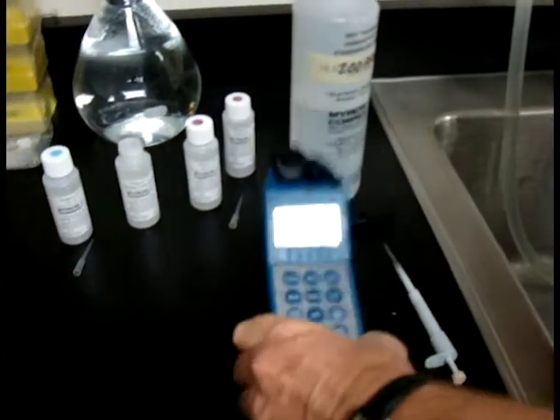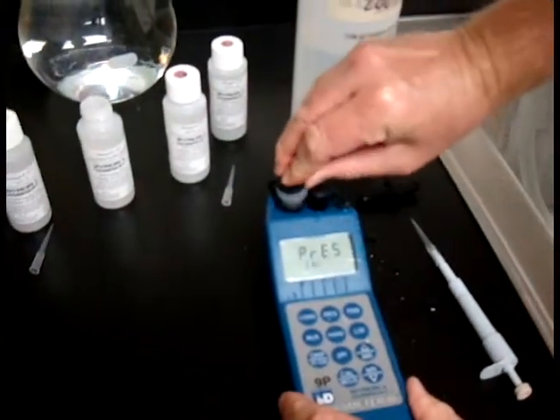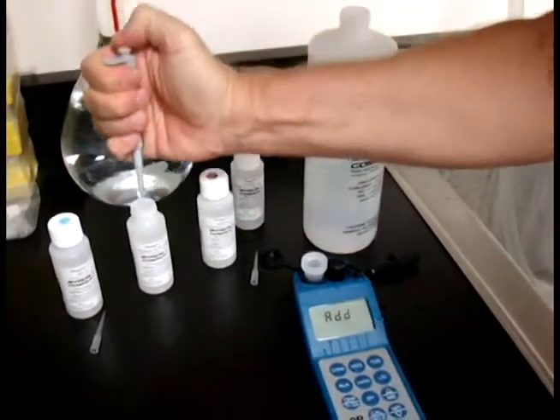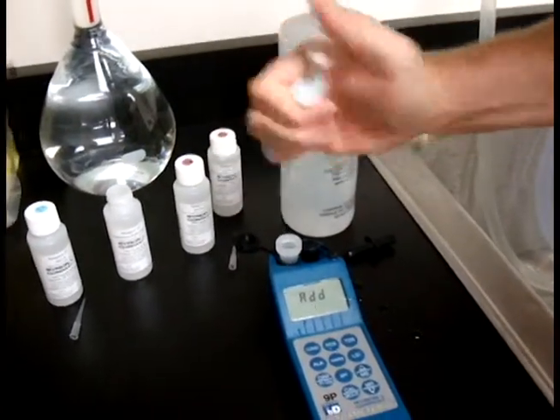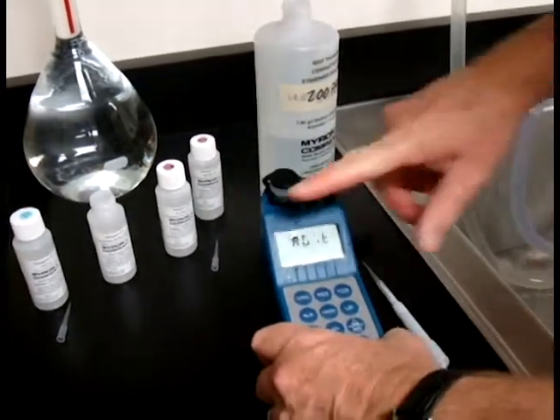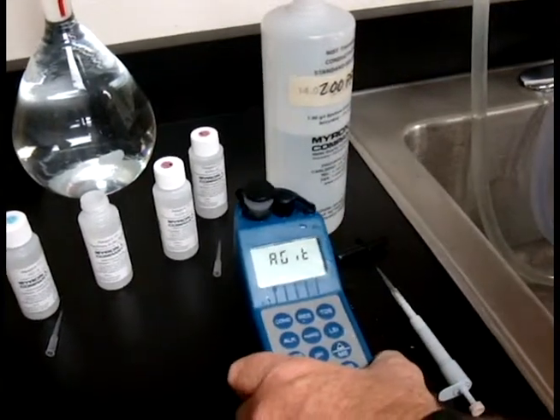You don't have to keep agitating just because it's blinking. Press Cal. I like to open up my cap first, get ready, then hit Cal. Add some more H1, put the cap back on, and agitate as the screen shows you. Again, just three or four good little shakes is all it needs.